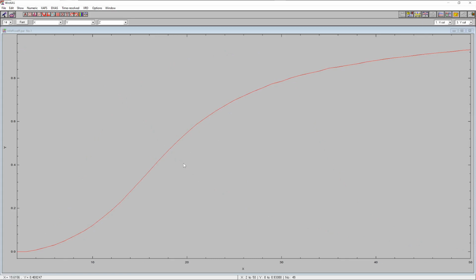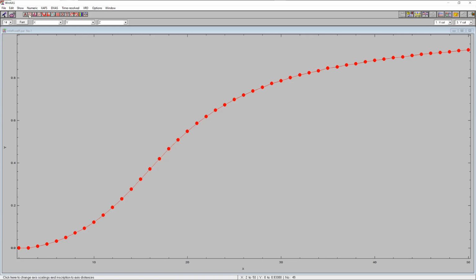So now if we go to column 25, which is about here, we see we are at roughly 70 plus for the molybdenum dioxide, and so about 30 for the molybdenum trioxide. So those concentrations basically at those data points, which corresponds to the columns here, will be used in the macro.